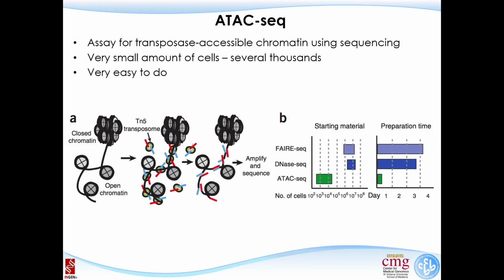ATAC-seq is another technology. This is the first year we will devote some of the lecture to talk about that as well. It stands for Assay for Transposase-Accessible Chromatin using Sequencing. Those never make sense.